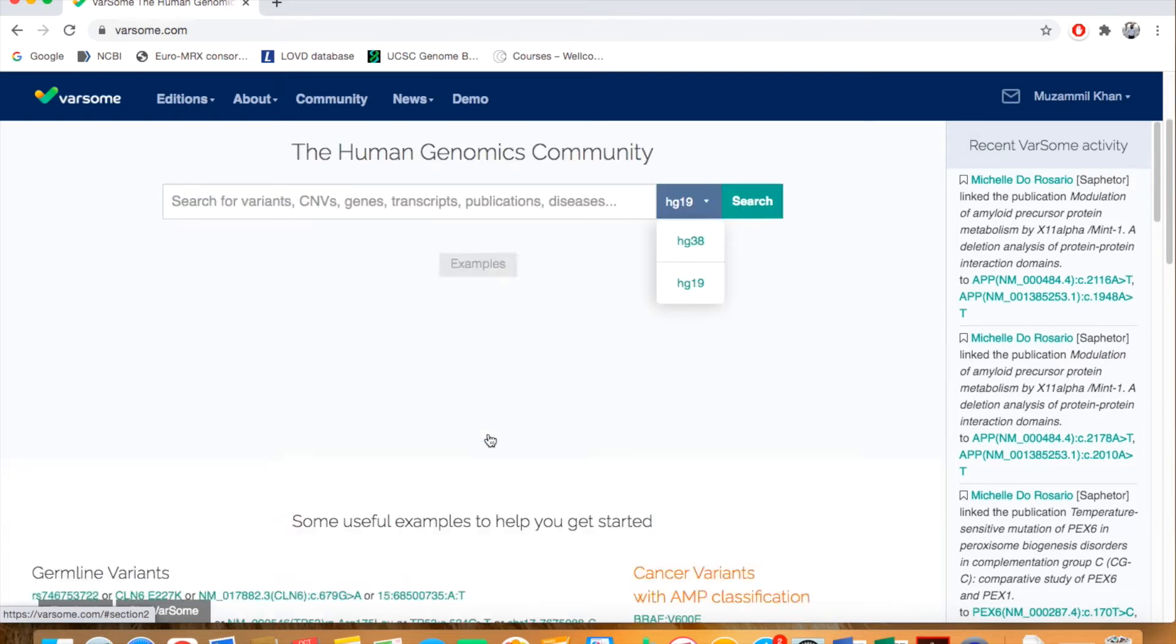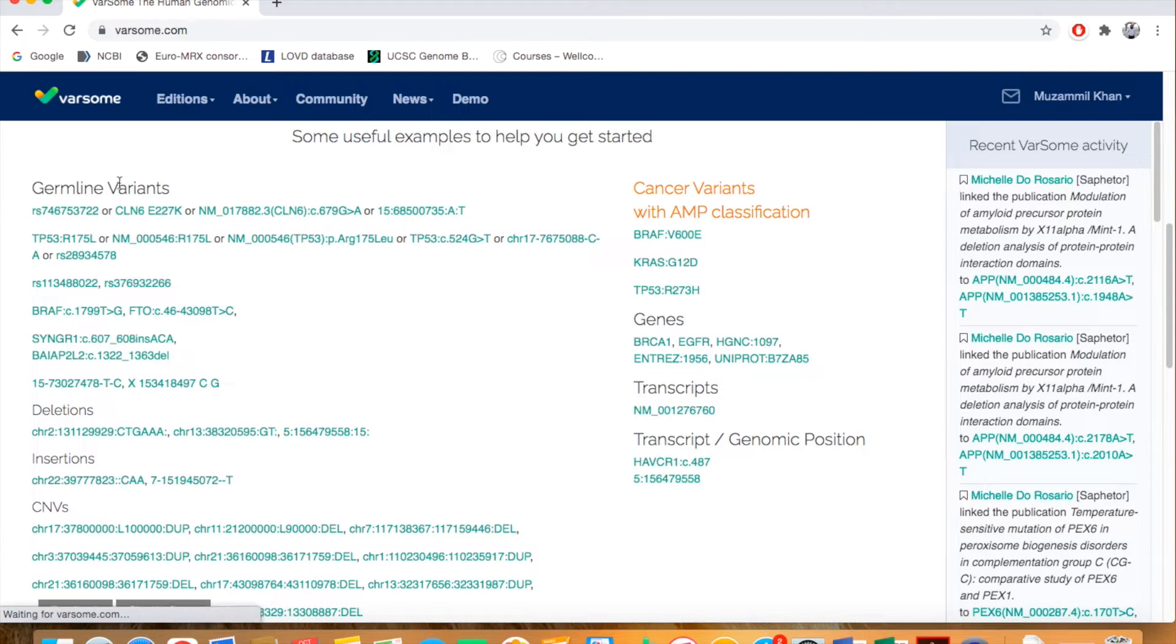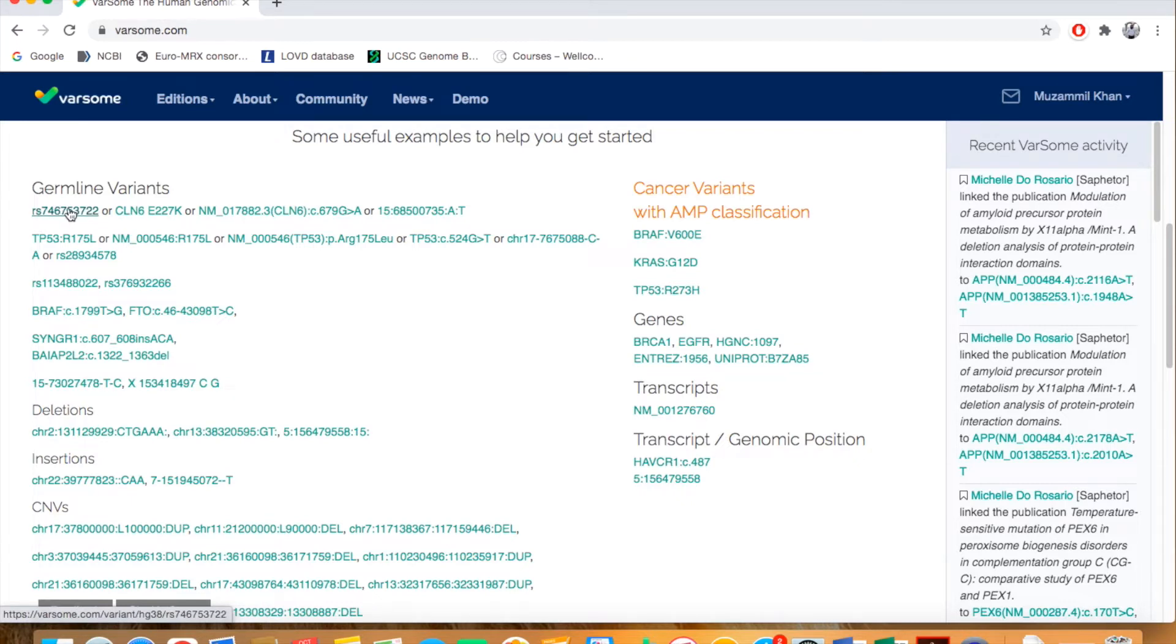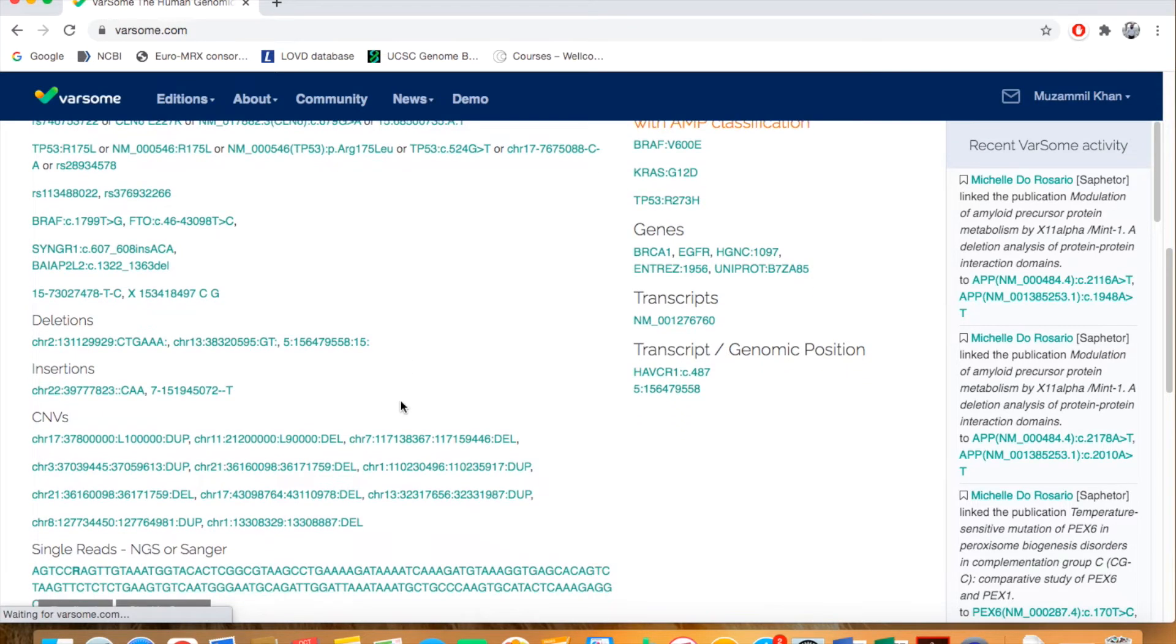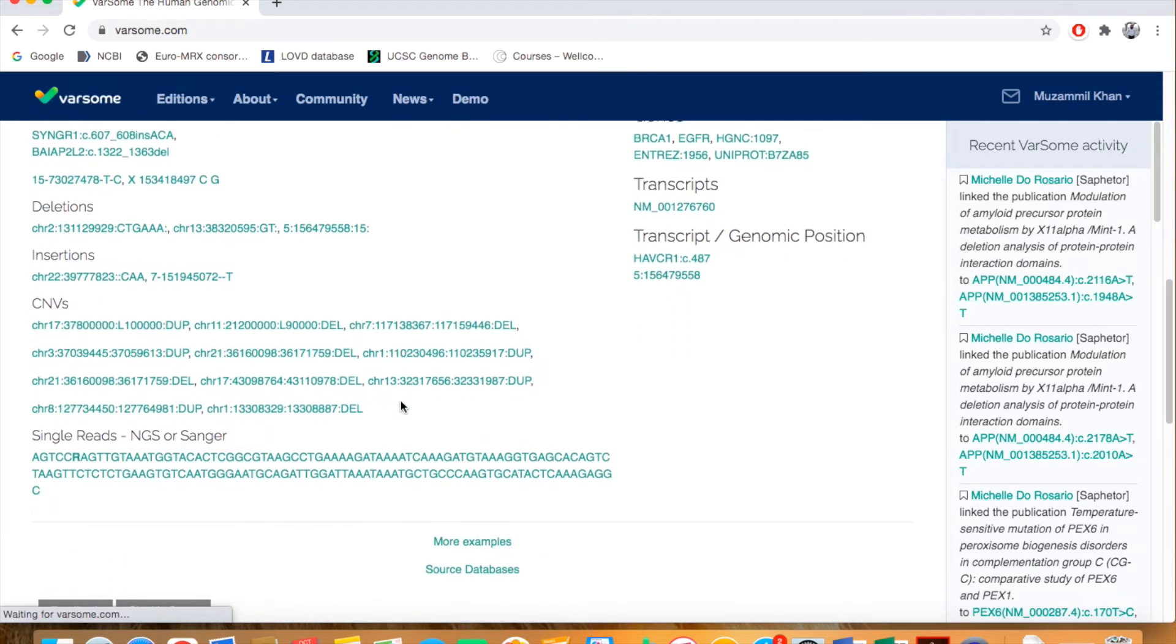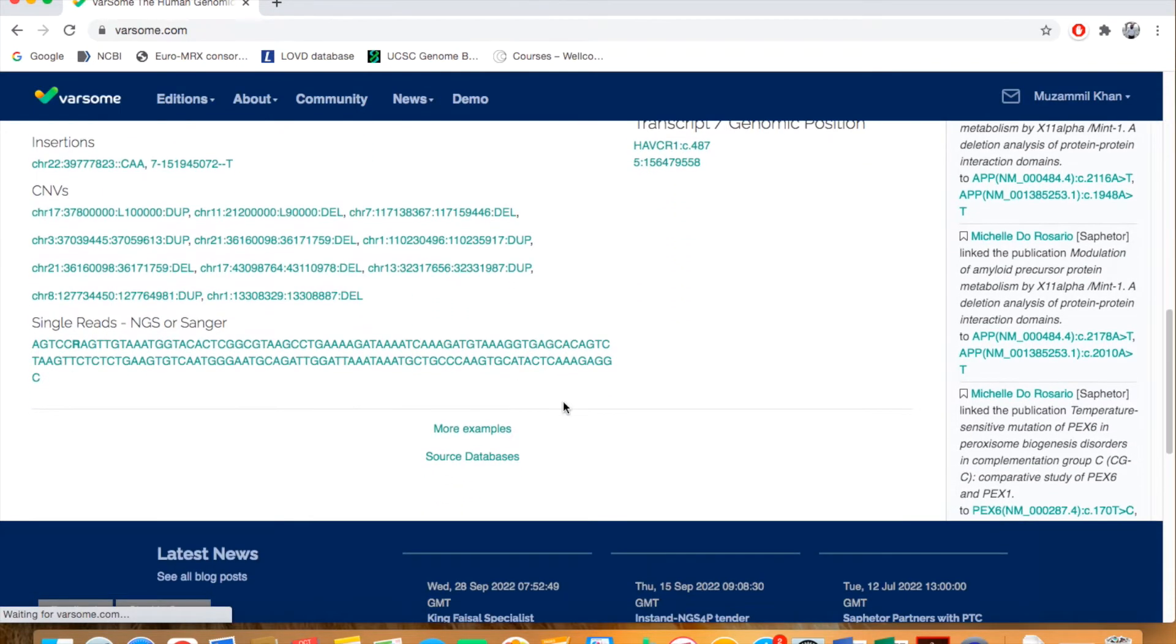Just click on this example and here you can see a list of different examples. For germline variants, you can even give the reference SNP number, the RS number of the SNP, and then you can get the interpretation plus all the information and annotation as well. These are all the examples you can see and learn from the format to be used in Varsom.